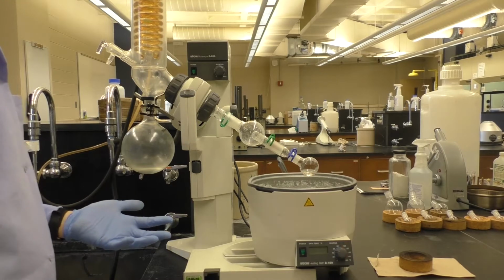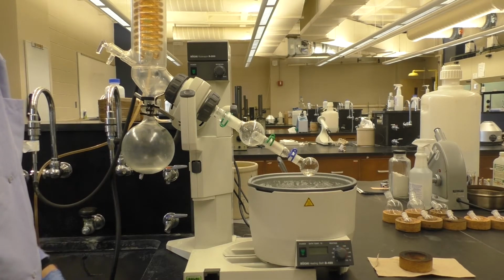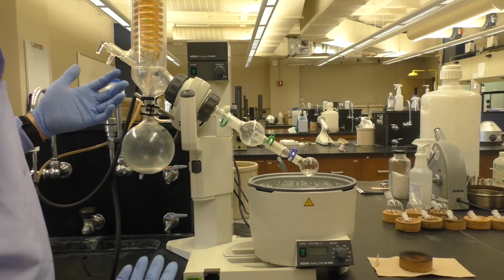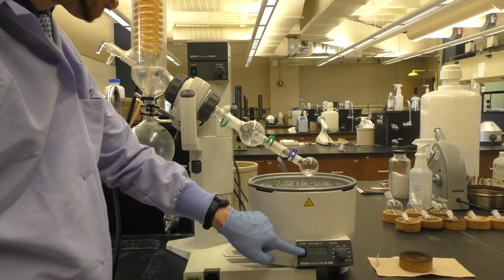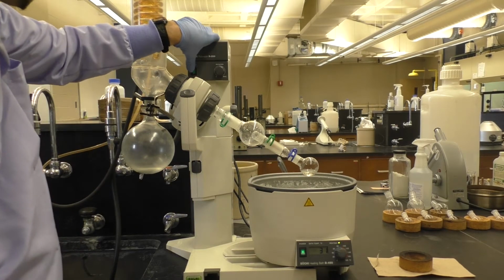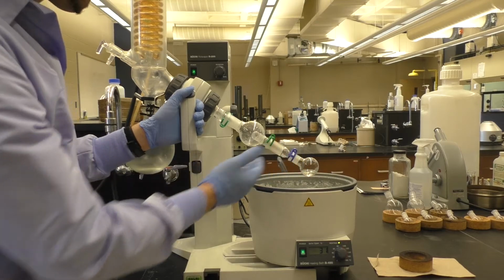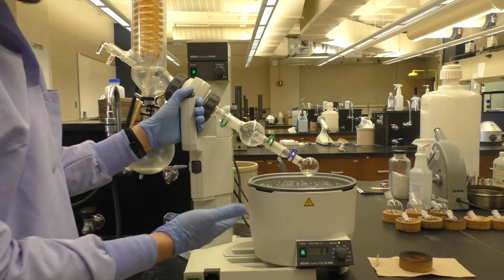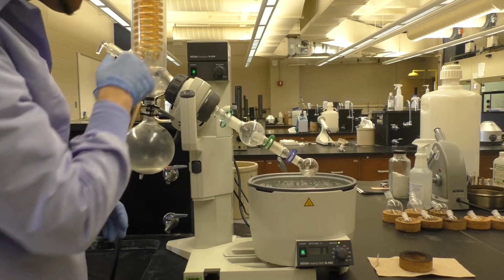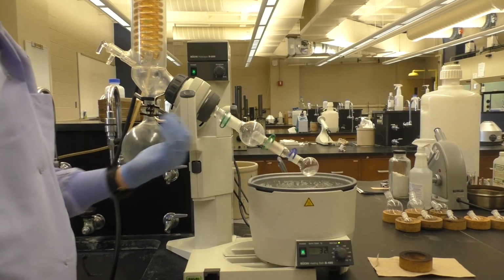The other advantage with a Rotovap is, you might wonder why such a fancy system. Couldn't we simply pull a vacuum in another way, by having it maybe in the filter flask or something along those lines? Well, a Rotovap allows you to do two things. It allows you to turn on the water bath below here, which we can apply heat to the system. Now, how does that work? Well, I have another column here I can turn on, which allows me to do two things. I can lower the flask I want to rotovap into the water bath so that it can be heated. And then also I can turn the rotation on so that I get even heating and even distribution and stirring while it's evaporating, which significantly helps.